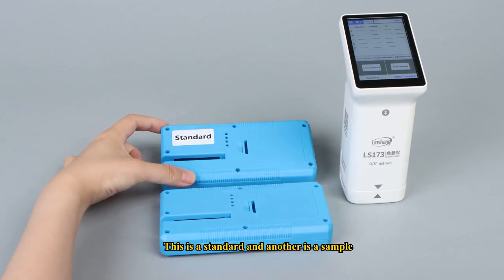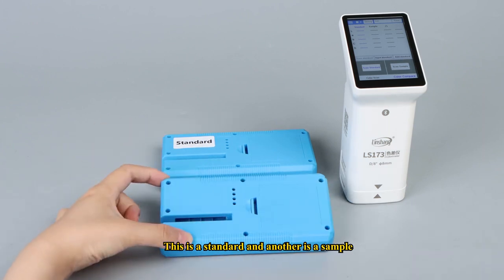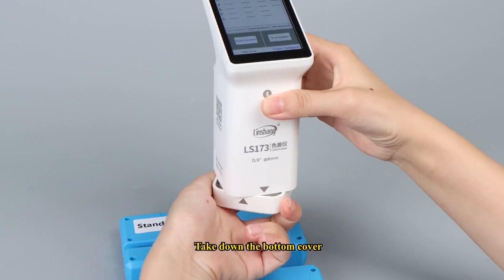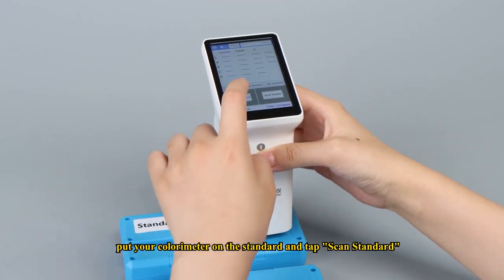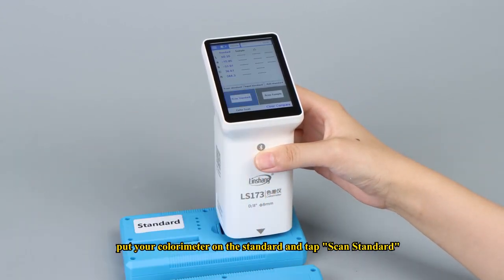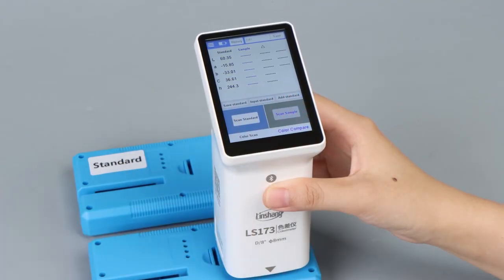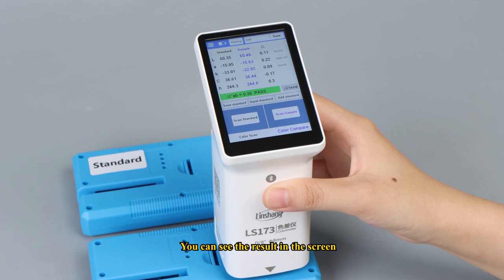One display is the standard and another is the sample. Let's start to measure. Take down the bottom cover, put your colorimeter on the standard and tap scan standard. Then move to the sample and tap scan sample. You can see the result on the screen.